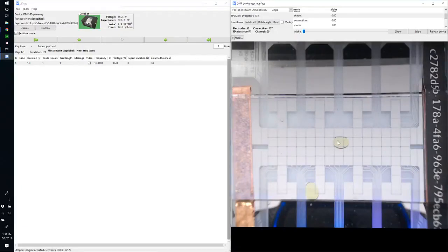So I'm going to calibrate it for this chip by right-clicking on an electrode that I have purposefully covered with liquid completely, and then by clicking Measure Liquid Capacitance. Oops, sorry. You have to actuate the electrode first, right-click, Measure Liquid Capacitance. And you can see that that has updated this value to 4.3 picofarads per millimeter squared.